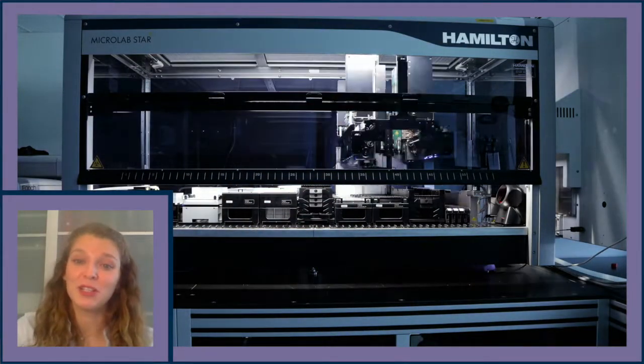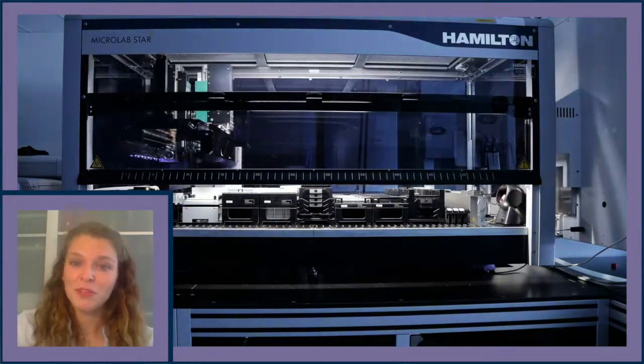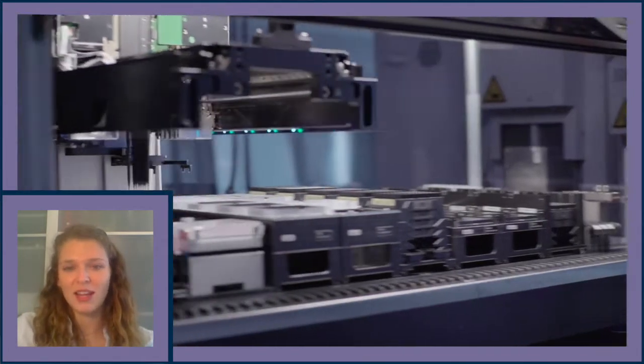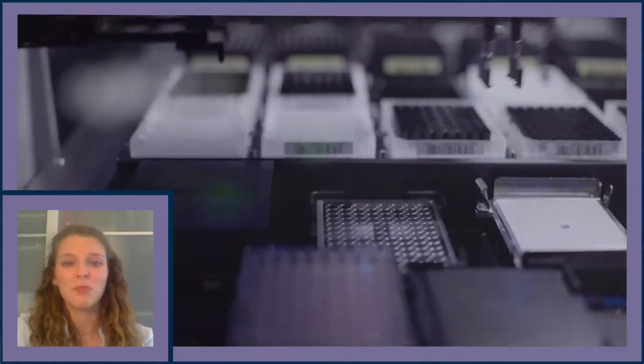Hi, I'm Mackenzie Koston. I'm a research associate at the Allen Institute for Cell Science on the microscopy team. Today we're going to show you our automated tissue culture platform. We've developed this platform to seed, passage, feed, and maintain the Allen Institute for Cell Science hiPSC lines.